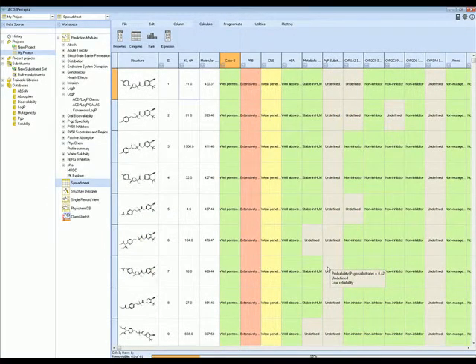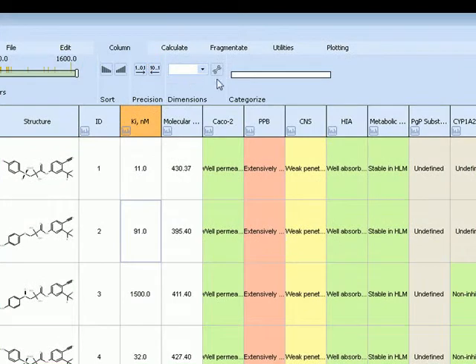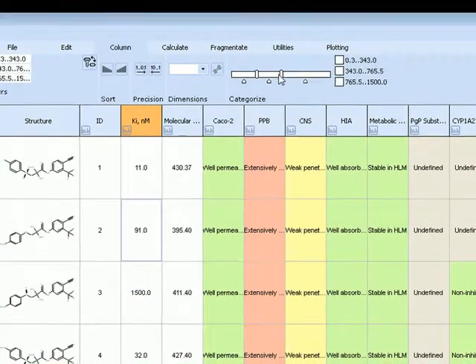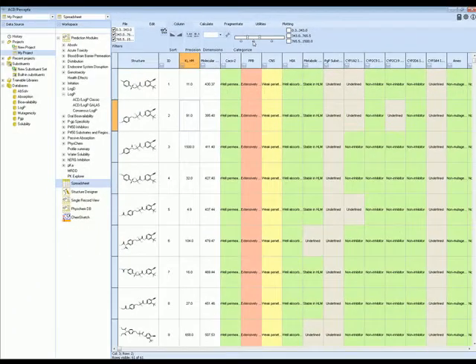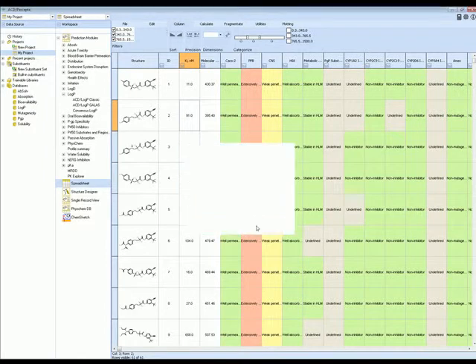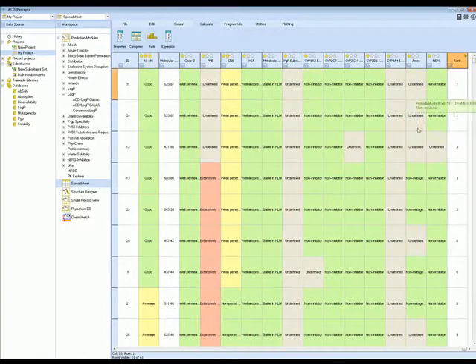Set thresholds of acceptable and unacceptable values and assign color codes to help quickly rank compounds. Even import your own data — potency, for example — to help rank your compounds.